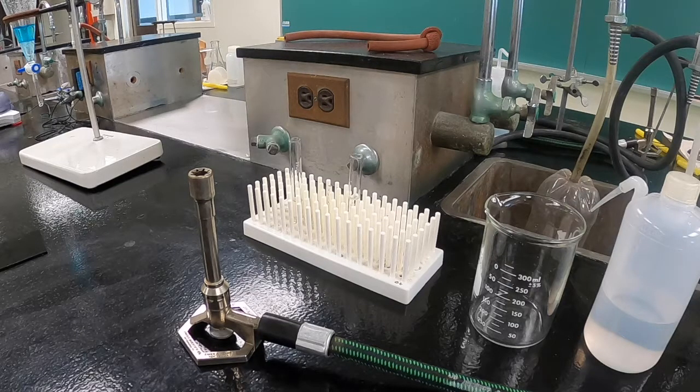Flame tests work because some substances, when introduced into a flame, will cause that flame to change color.